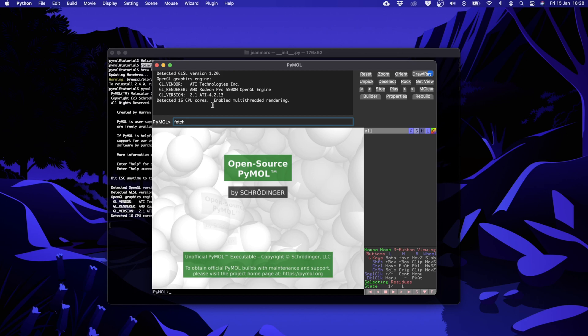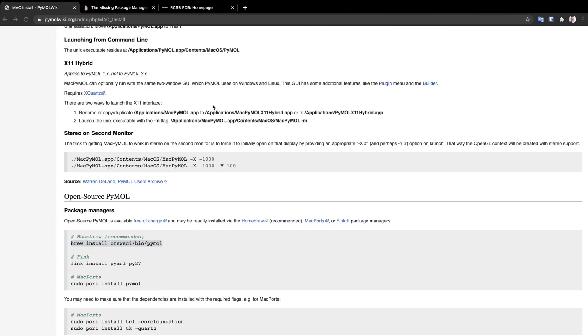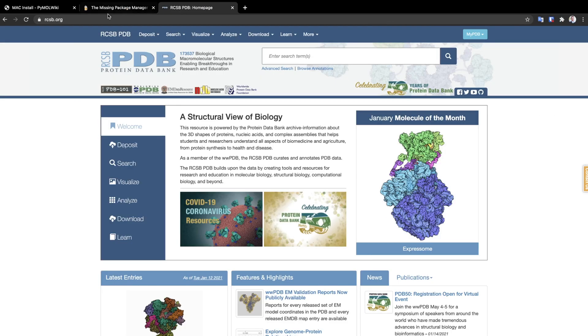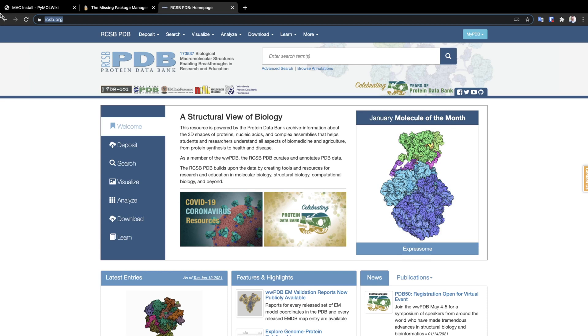So to find the code of the molecule that we want to load we need to go on the protein databank website which is rcsb.org. It is a great place where we can find a lot of 3D structures of biological molecules.